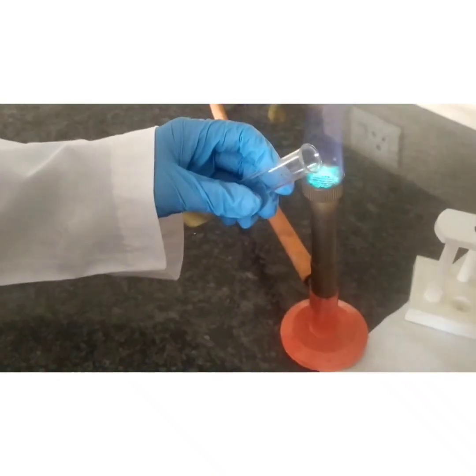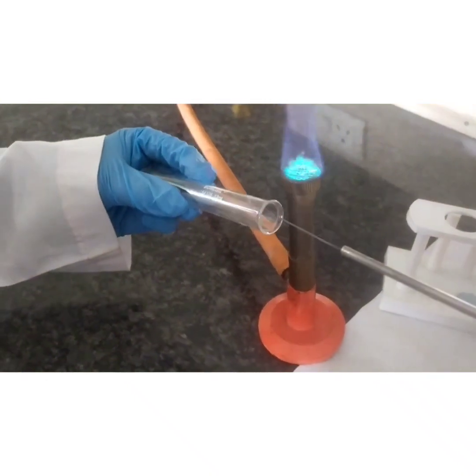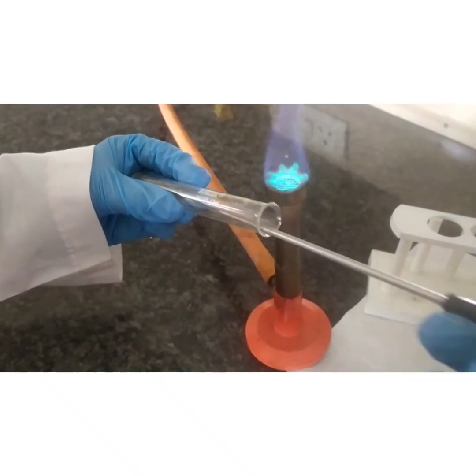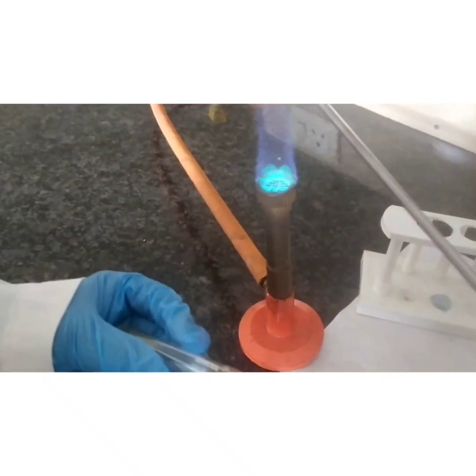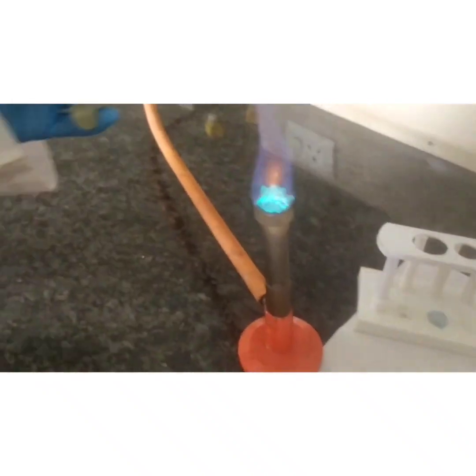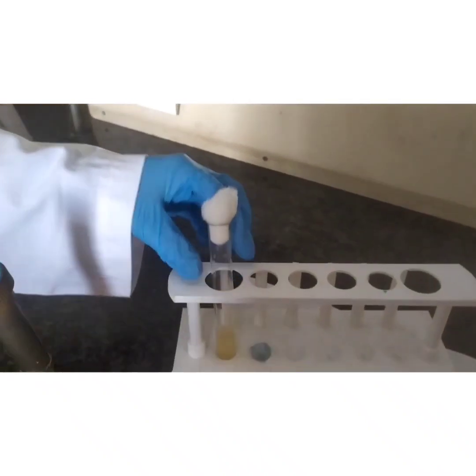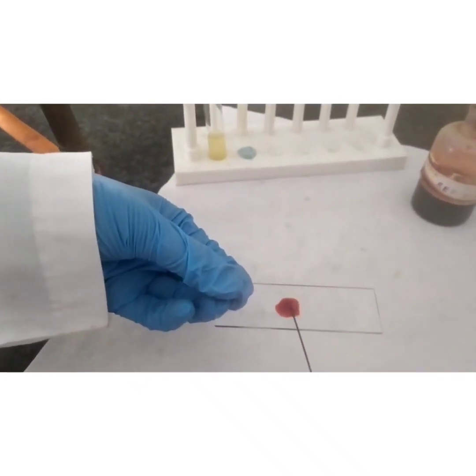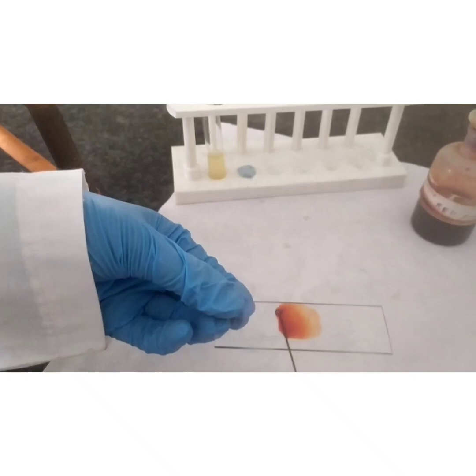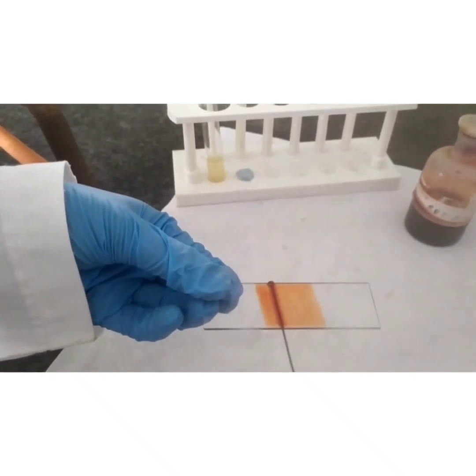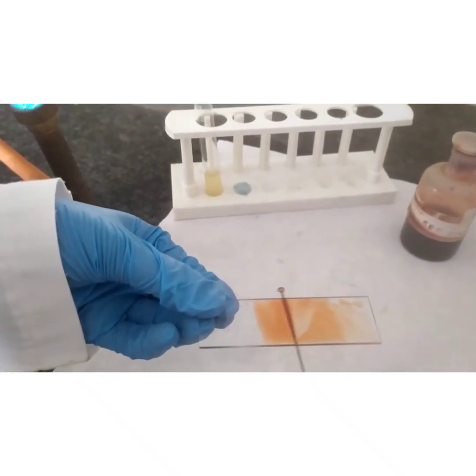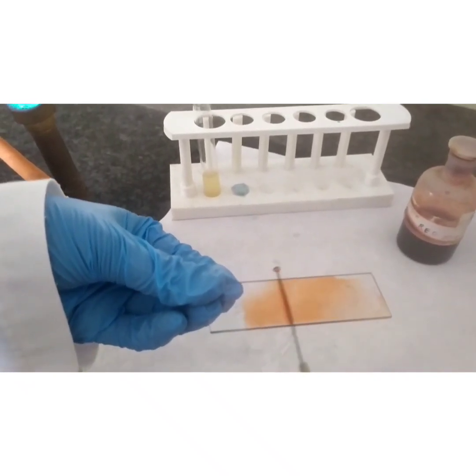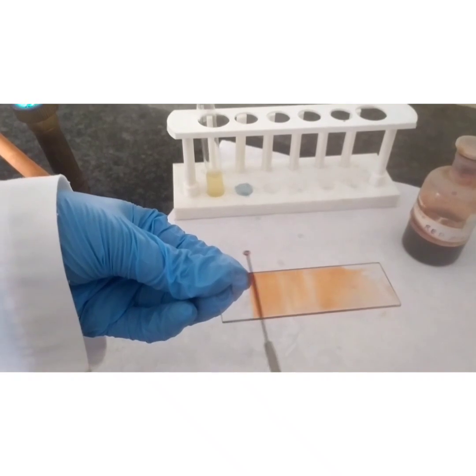Dip the inoculation loop into the bacterial suspension and take the organism. Place it on the Congo red stain which you have taken and mix the sample well. Gently mix the sample by holding your loop in the horizontal direction and evenly distribute this mixture throughout the slide.